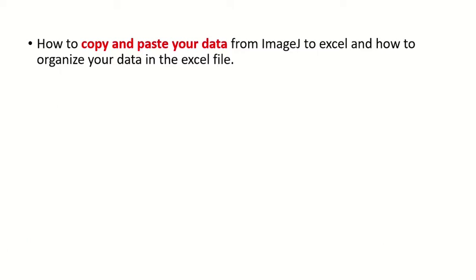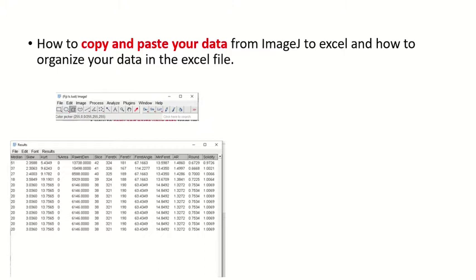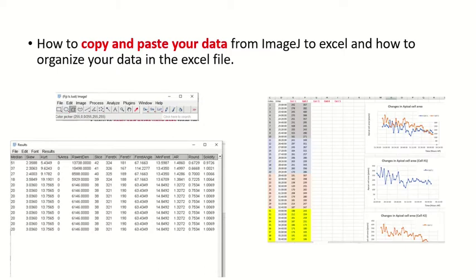In this video, I want to show you how to copy and paste your data from ImageJ to Excel, as well as how to organize your data in the Excel file. As you will get a lot of data, it is important that you organize it in a way that is easy to access in the long term.